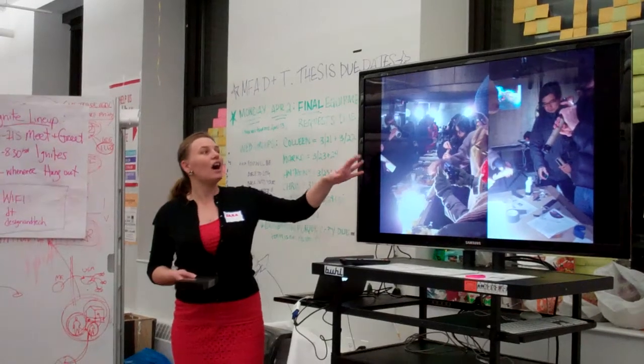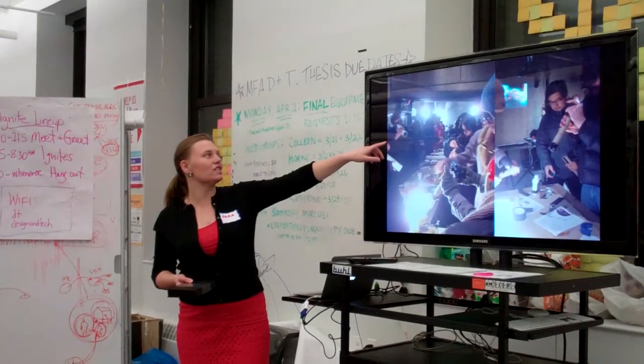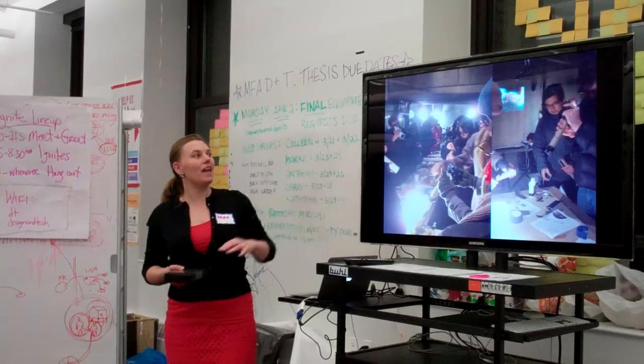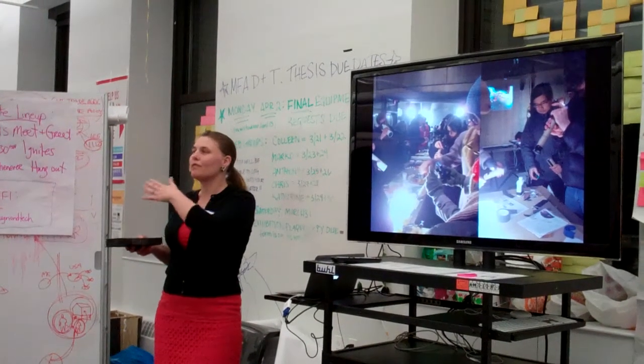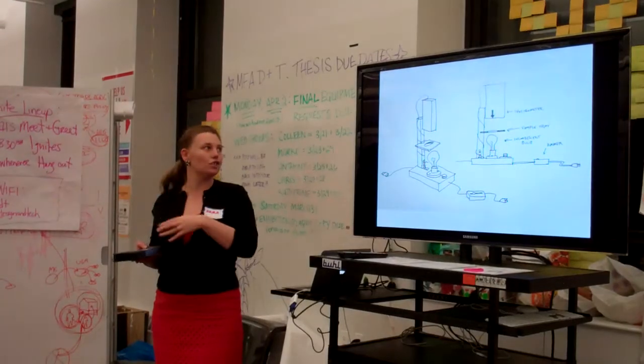We've been coming up with other versions of spectrometers. This is just a tube with a slit cut in the end and a broken piece of CD. You can take a photograph of the spectra that's cast inside of the tube.